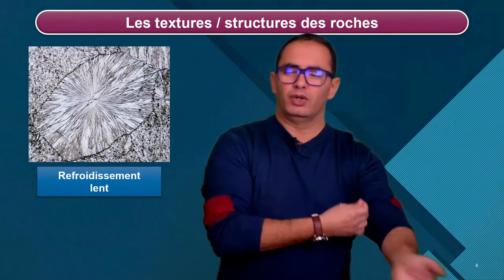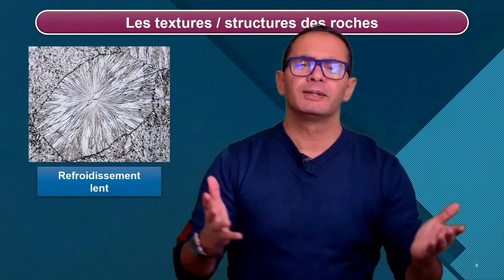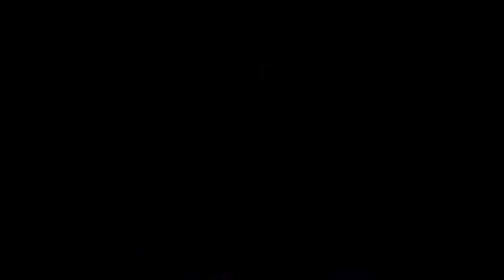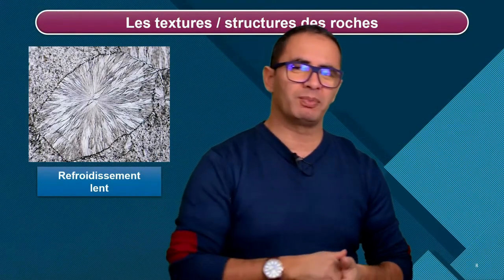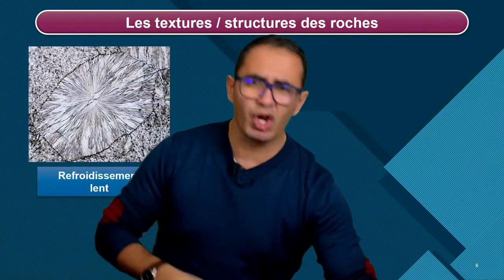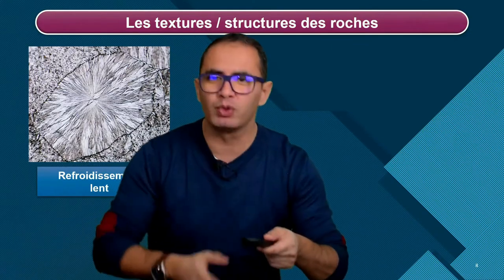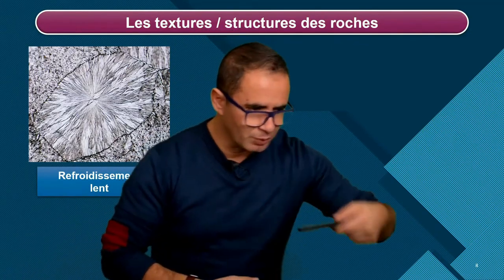Une fois qu'on obtient ça, je propose aux gamins : « Mais on ne pourrait pas modifier la formation du minéral ? » Et là, il y a toujours quelqu'un qui dit : « On n'a qu'à changer le refroidissement. » Et on part sur la conception d'un protocole expérimental. Ça part très vite : « Je vais chercher un bloc bleu de congélation. » Ils prennent leur lame et la posent dessus pendant quelques secondes. Puis ils observent au microscope.